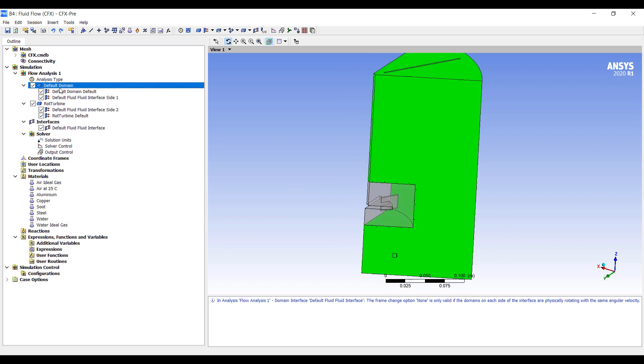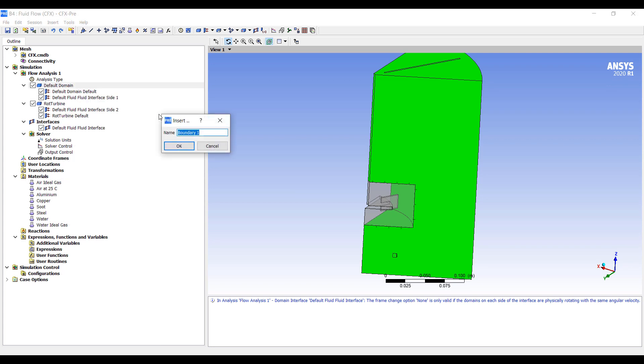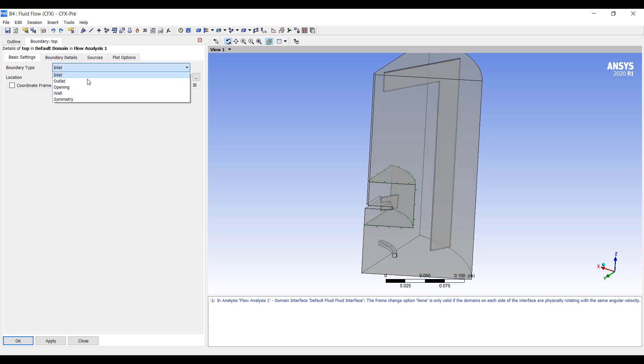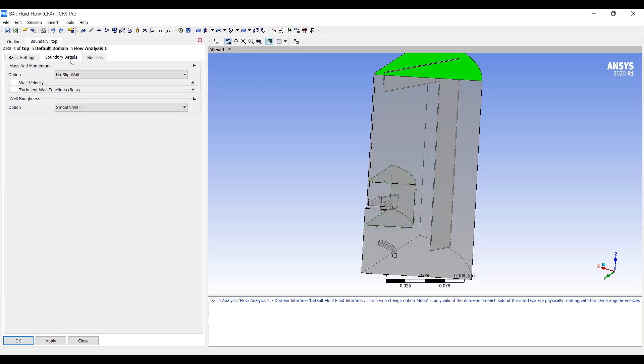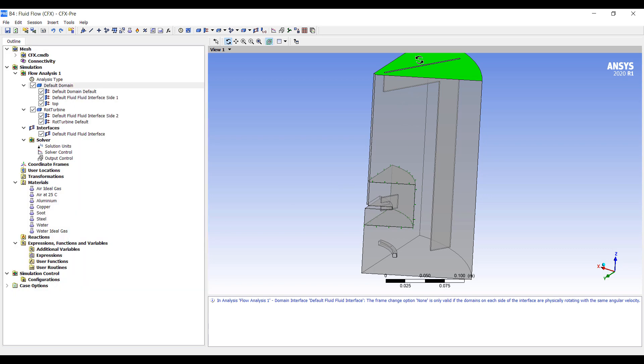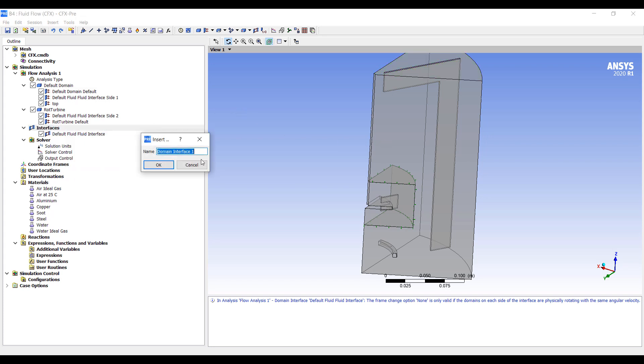But here we'll set up some basic boundaries. So let's have a top boundary. Top boundary will be a wall. Later on we'll use a degassing boundary when we start the multiphase flow. But right now we're going to set this as a free-slip wall to model as if there's nothing up there. Everything else is set up. We want to put in a domain interface. So this will be stationary, static, periodic.